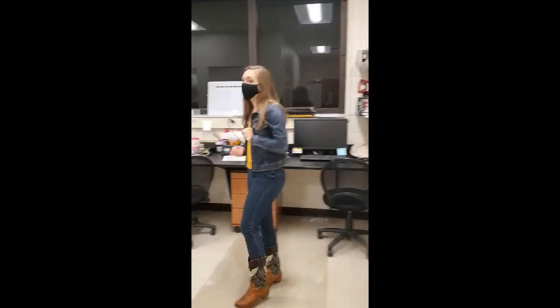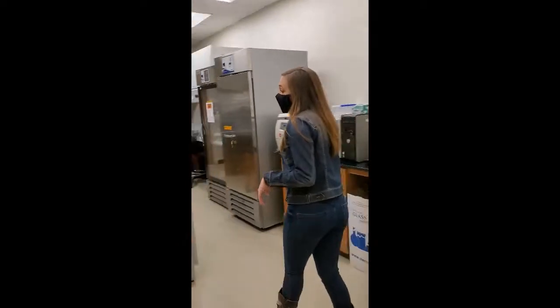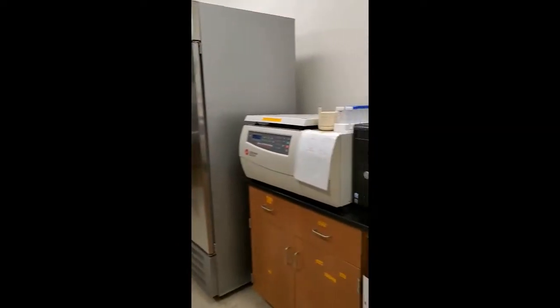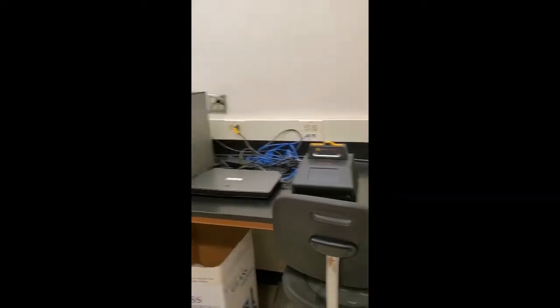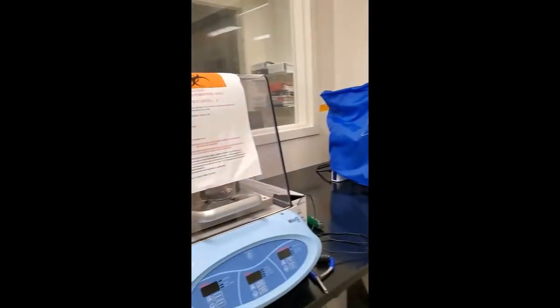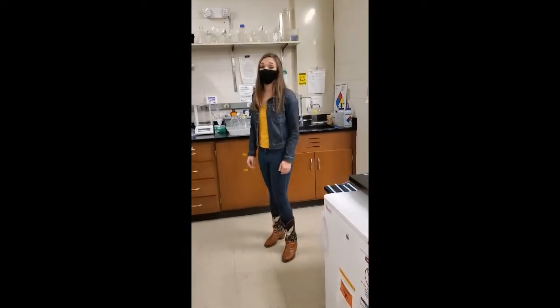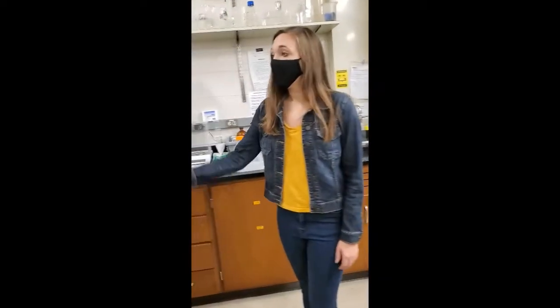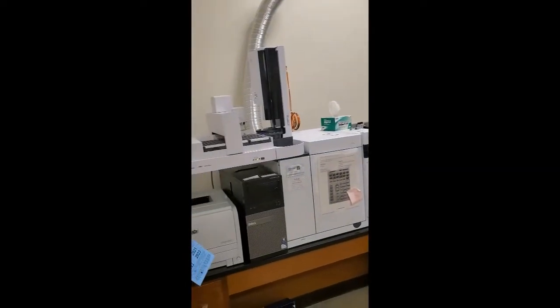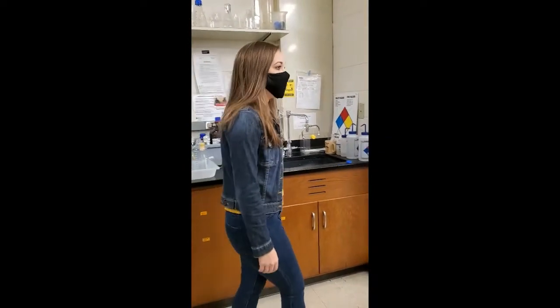We have a full GC that I can show you. We are set up to run PCR on samples, as well as do quick qPCR with our fun little Chai system over there. Please excuse our mess. We got a lot going on in here. We got a lot of different projects. I think there's at least 6 people working on different research projects right now. Like I mentioned, we've got a GC in here, which is pretty cool. We combine chemistry and biology all in one. So yeah, we got a lot going on.